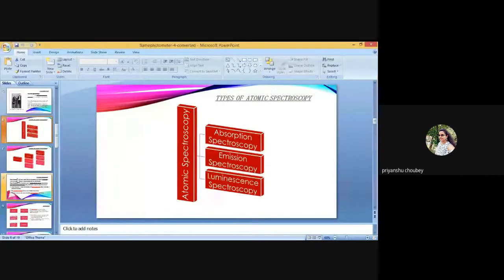Switch on the instrument and allow at least 30 minutes for a warm up. Switch on the deuterium lamp for a background correction, which is generally required when the wavelength of the resonance line of the element is less than 250 nm.